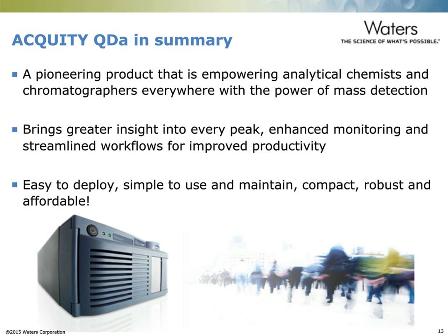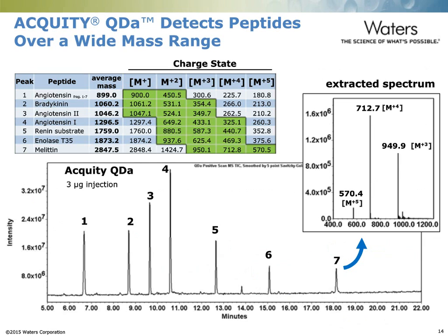So with that, I want to transition and start to discuss some of the specific applications where we've seen the QDA be useful. First, starting with looking at peptide analysis. So this is an example of some of the early work we had done with the AcuityQDA to investigate how applicable it would be for peptide analysis.